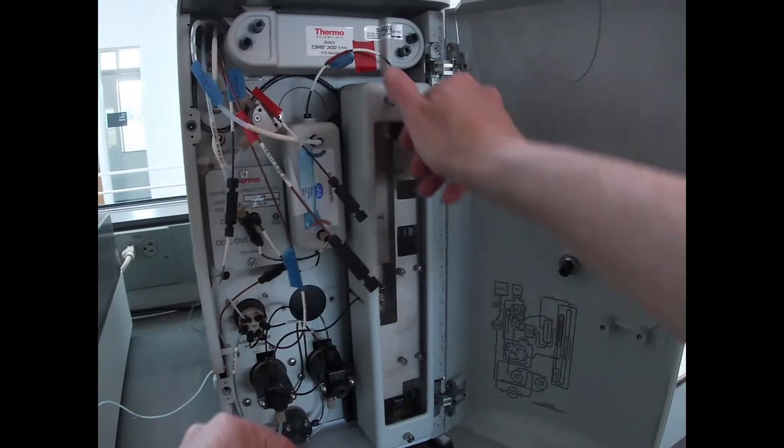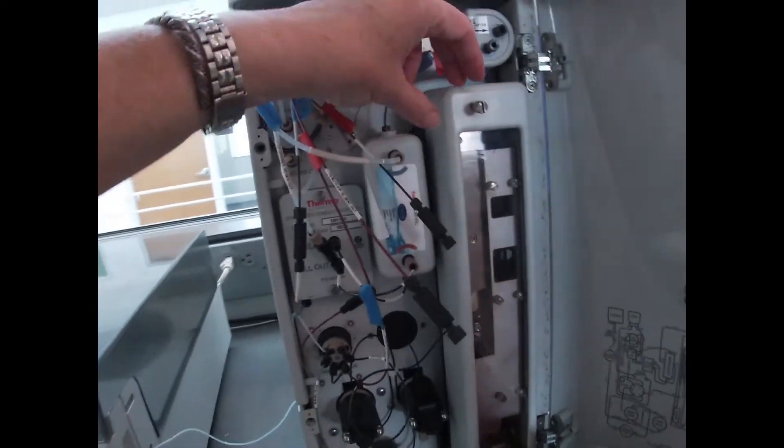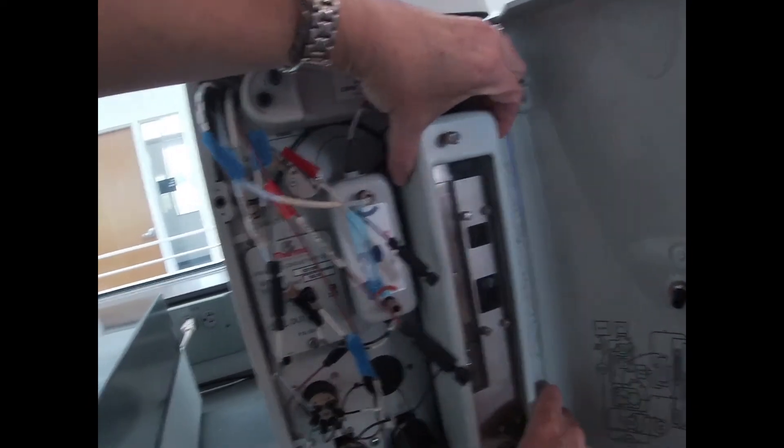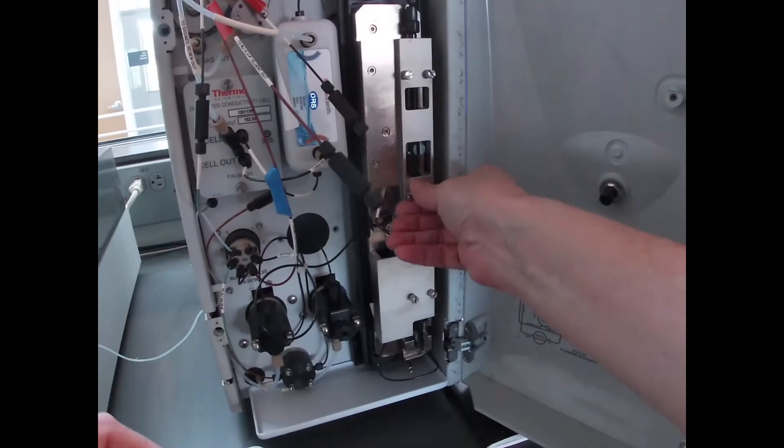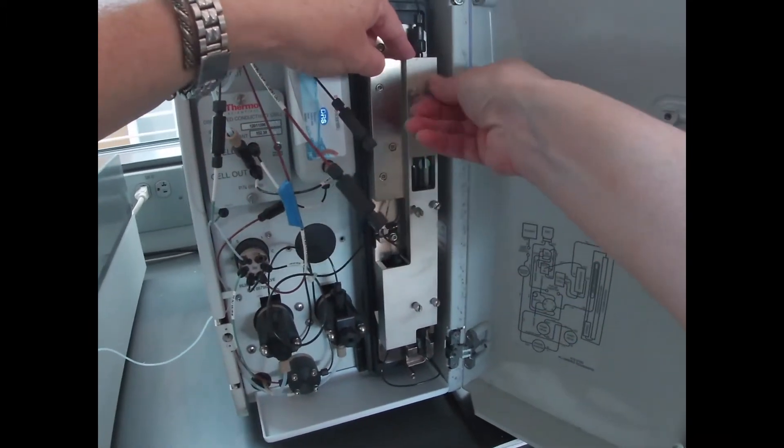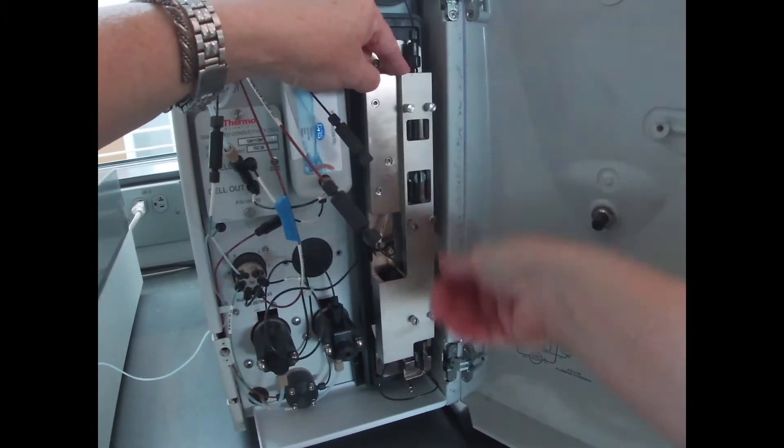Our solution runs in here where our columns live. We have a heat plate that allows us to control the temperature of the columns.